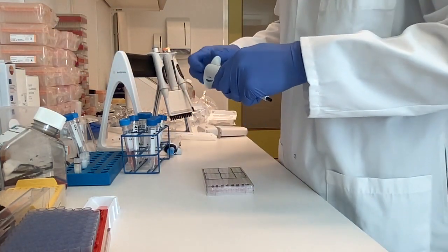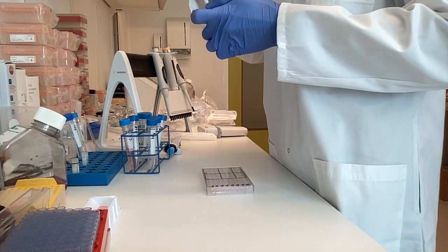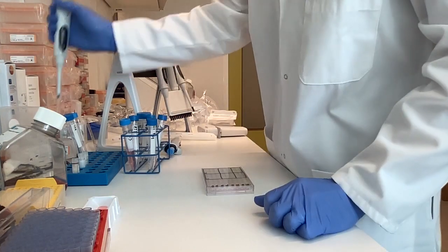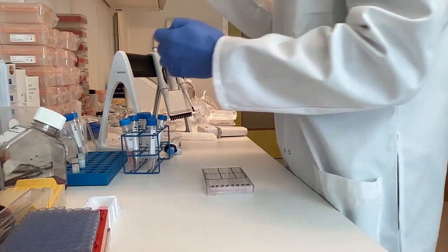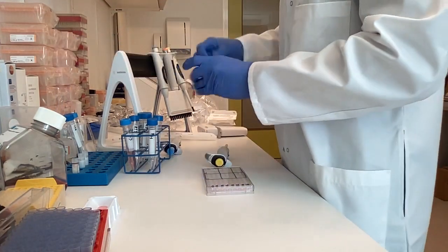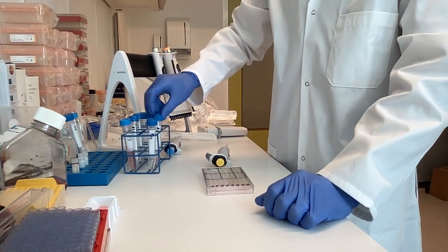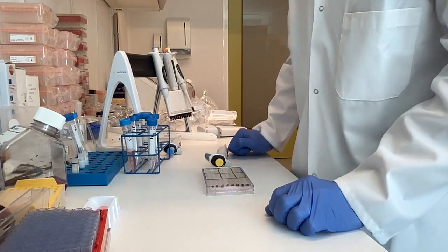And then we take our product 1 and add 20 microliters of it. We do the same for product number 2 and put it in our A2 tube. And then of course vortex to mix. So now we prepared our highest concentration of our product that needs to be tested without any spike, so without any LPS.